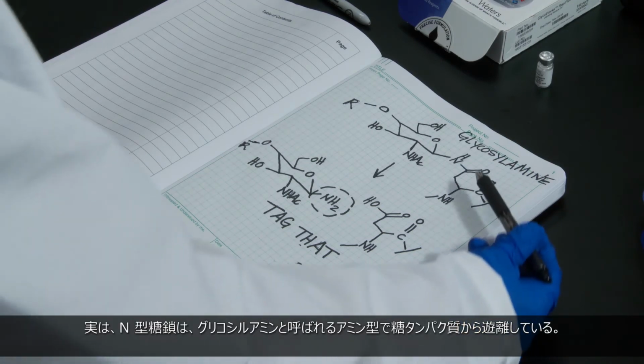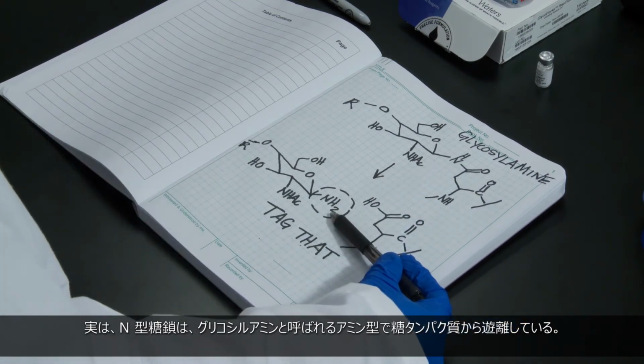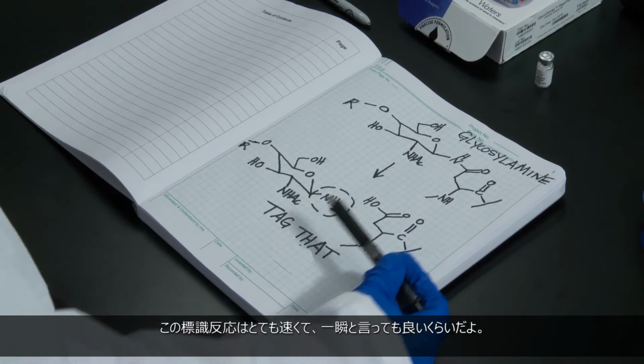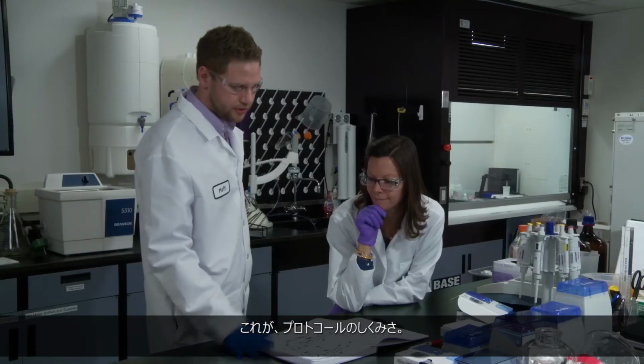N glycans are actually released from glycoproteins in an amine form that we refer to as glycosylamines. With the right electrophilic reagent, this amine can be rapidly tagged. And the labeling reaction is remarkably fast, being near instantaneous. And that's how we do it.